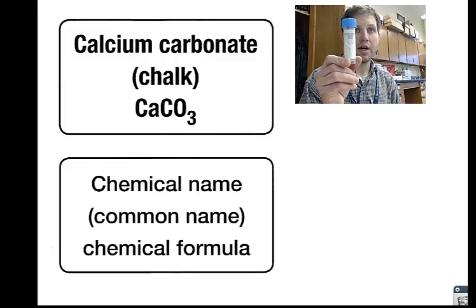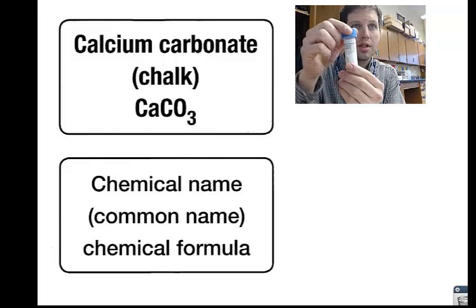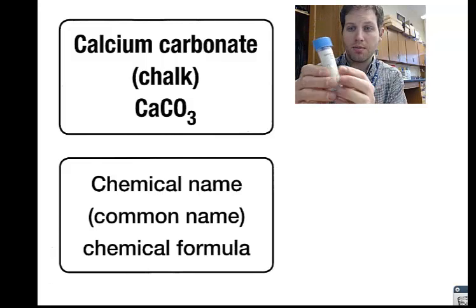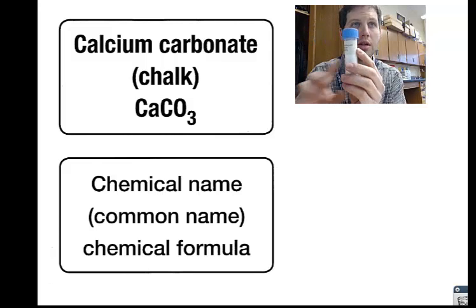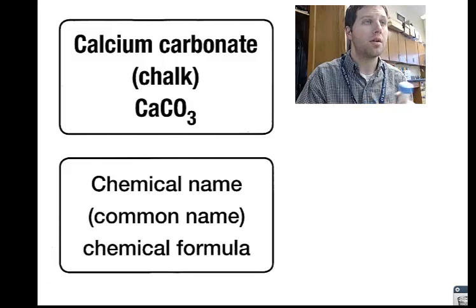So this is what one of your vials looks like. It's got a blue cap. Please leave it closed today. Don't open them up. And on it you're going to see a label on your vial, and it looks very similar to the label you see on the screen right here.